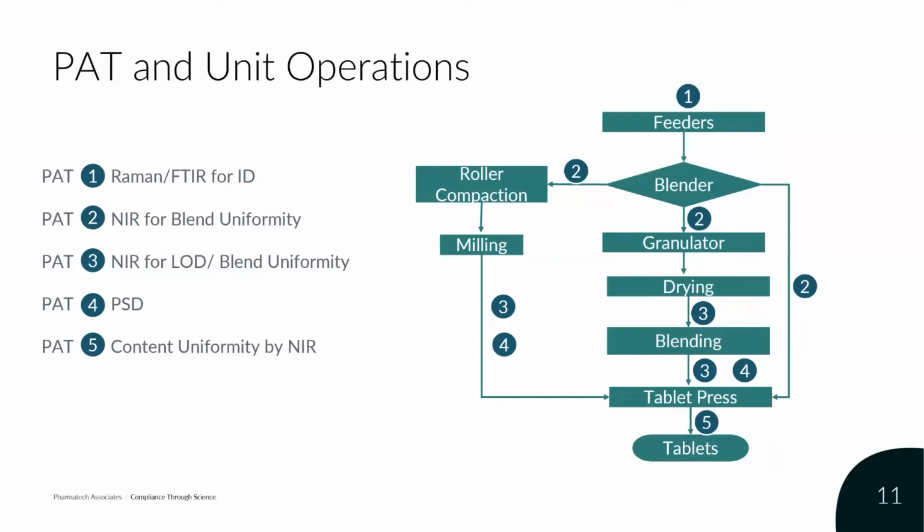Likewise, for wet granulation processes, moisture content is always going to be a critical control parameter that affects the quality of the finished product. It's important to know exactly how much water content or moisture content you have. This can be captured on the fly and makes it a lot easier rather than having to sample and run the risk of this sort of a bias in your sampling, and that then has to be sent to the lab for maybe Karl Fischer analysis.